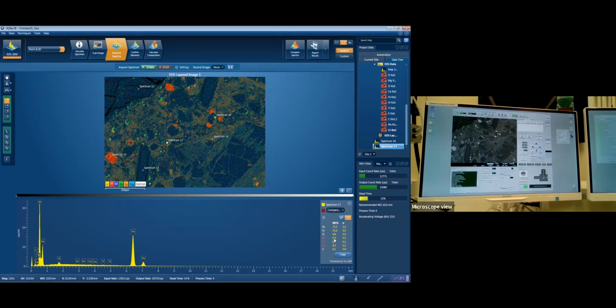So sometimes you get a little bit of an overlap between the, like, so you're looking, Jen points out on the graph, you have these peaks. Each one that's peaked up is unique to each element, but sometimes you can get a little bit of an overlap. They can come very close. So whether it's a very low percentage, it might overlap with them, but also because it's such a low percentage, it might be confused as noise, or it might think that a little bit of noise is an element that isn't actually in there. In this case, it's using indium and calcium.